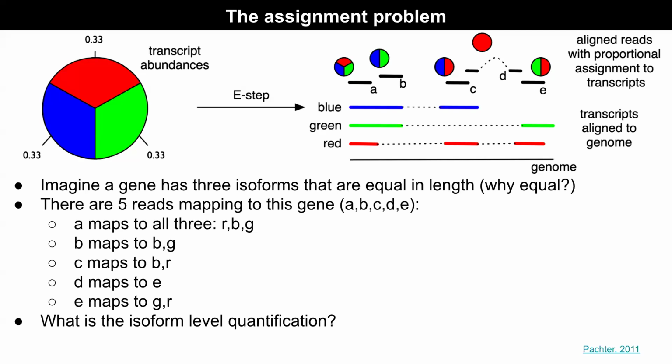You begin with D, which is there only in E. So that gets assigned. Very good. What about the others? D is the simplest case, right? D aligns only to, sorry, red. This read, which is split, aligns only to isoform red, which means that at least one copy of isoform red should exist. That's how this read can originate. Otherwise, there's no possibility of the read originating. So let's say D, we can delete it. What about the other reads?